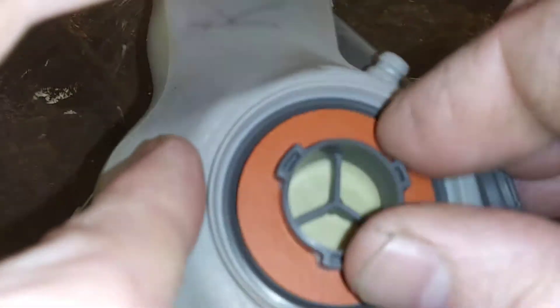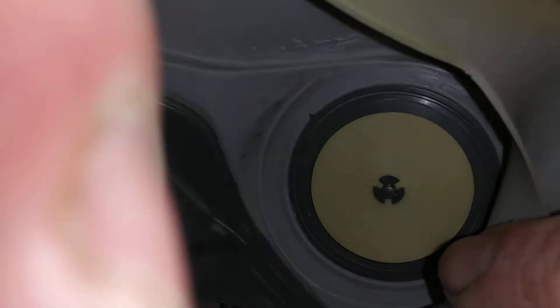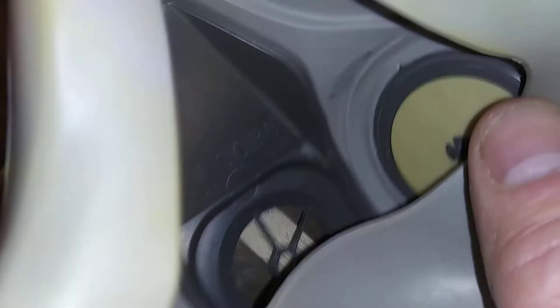On each side you've got your little orange rings and they will come out as well. Take one out of each side so you can clean it, and on the inside there's one on each side. Be careful when you take them out that you don't tear them.